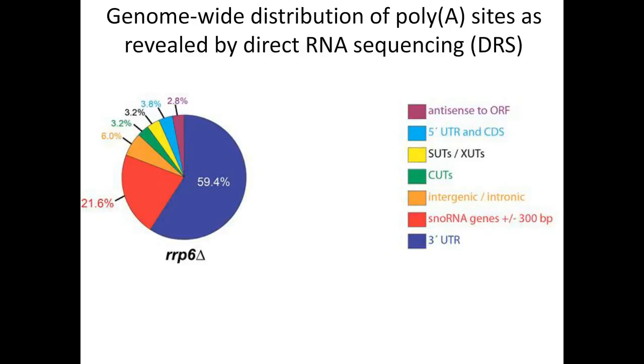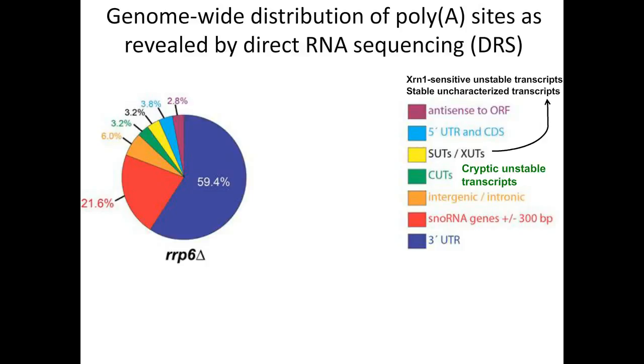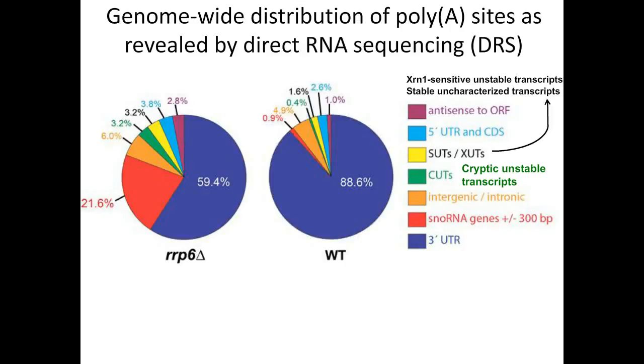However, we see that in these cells, a large fraction of the transcripts come from these other categories of genes, in particular the snoRNA genes, which are small nucleolar RNAs that are involved in ribosome biogenesis. And we also see these other cryptic transcripts, in green, the cryptic unstable transcripts, and these other categories of transcripts that have ill-defined function but that are pervasively transcribed by the RNA polymerase. In comparison, wild-type cells exhibit nearly 90% of the reads mapping to the 3' UTR.